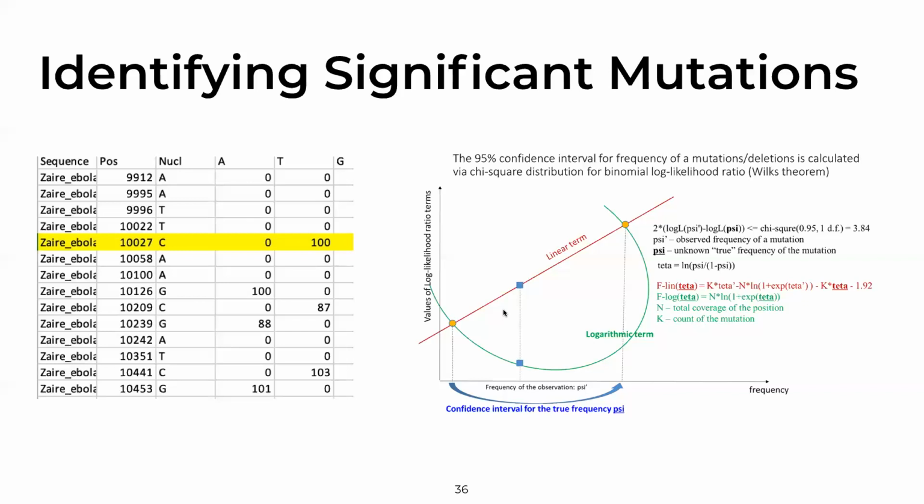The VCF calling, the calling of those variants, produces a file that says, out of all the possible positions that we've analyzed and we saw a change in, these are the ones that are good for annotation and interpretation, right? That's the point of those algorithms. What goes into it? Many different steps of first preparing the reads, then making sure that those reads are aligned to the best position, then making sure that you have enough reads out of how many you have per region, per gene, etc. And then a conclusion of something that you would like to annotate in the context of one single sample, or as shown here, in the context of a comparison between different regions.